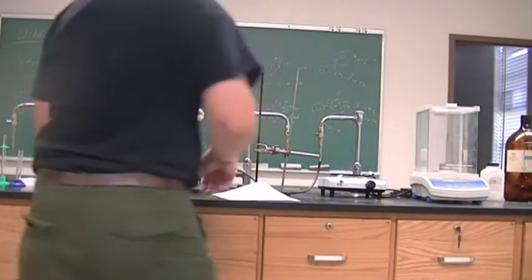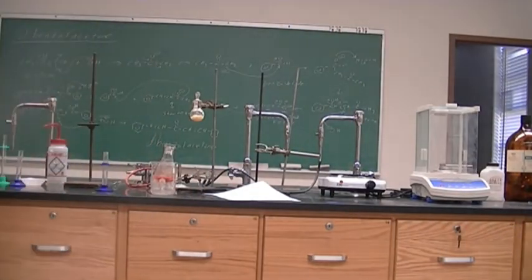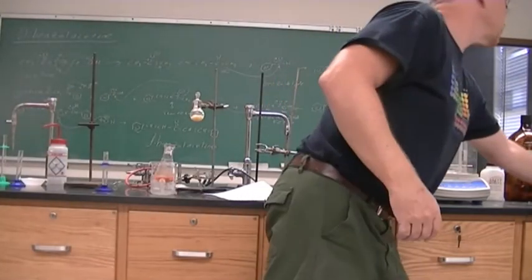Set up the suction filtration. Need a little bit of cold ethanol. Some ethanol.